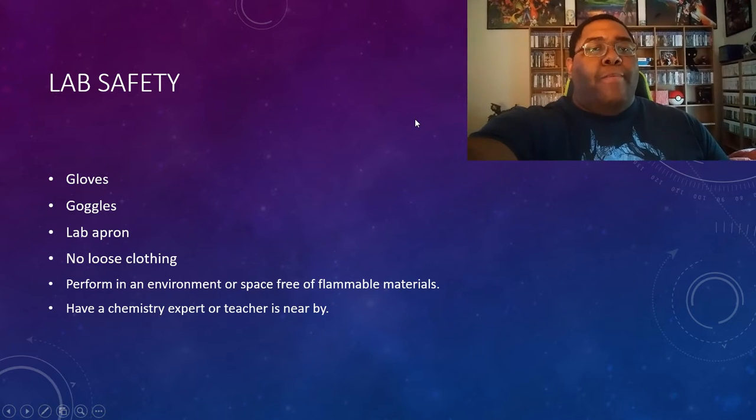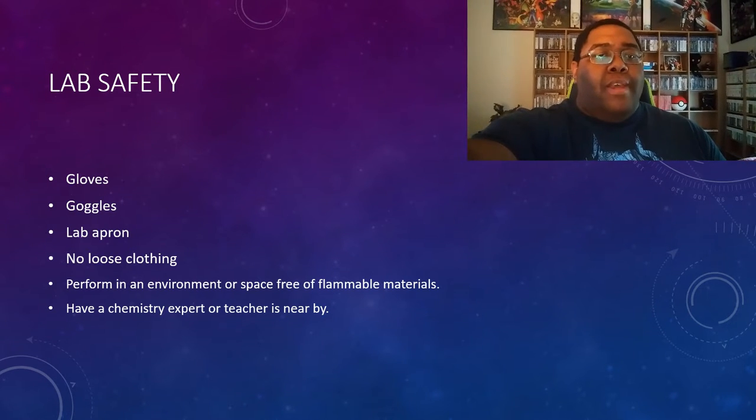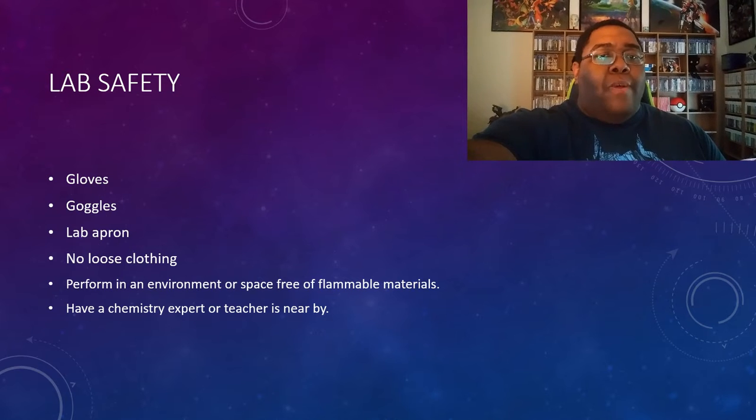Let's start off with the most important part of any lab: lab safety. Of course, like almost any other lab, you're going to need gloves, goggles, and a lab apron.